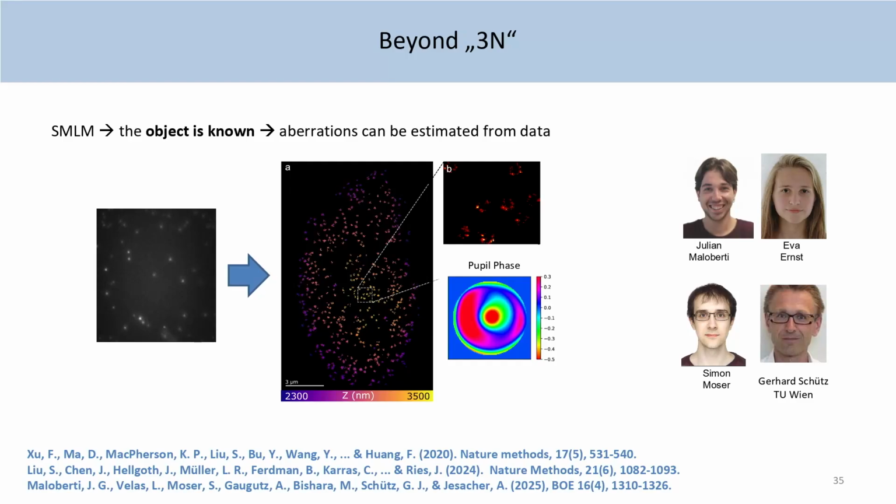And then you can do either digital AO, which gives you a higher success rate when fitting your molecules. It doesn't increase the precision though. That's an important difference between digital and physical AO. Or you can feed back the found shape to a light modulator, then you do physical AO, you increase the physical information in your raw data and therefore get a higher precision.